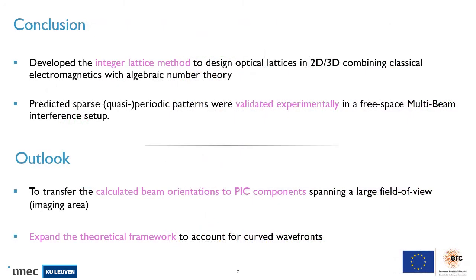To conclude, a theoretical framework was developed to generate arbitrary, highly tunable illumination patterns in planar geometry, thus translatable to chip geometry. The patterns were also experimentally verified in a free space optical setup. What remains is to translate these beam configurations to photonic integrated circuit components, such that the desired patterns can be generated over large areas for a large field of view of the microscope.